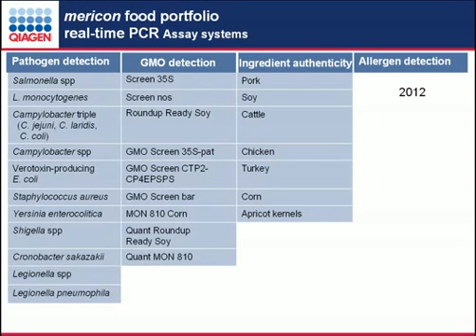assays. We have some for GMO detection, some screening, one looking at Roundup Ready soy, several, again, for a variety of screens, and then 2 quantitative assays, one quantitative Roundup Ready soy and quantitative MON 810. And this is because European regulations require that you prove that there is no GMO, or if there is GMO, that you have to quantitate how much is there. If there are some certain, it's like 0.9% is allowed.